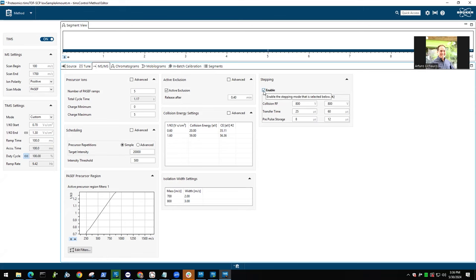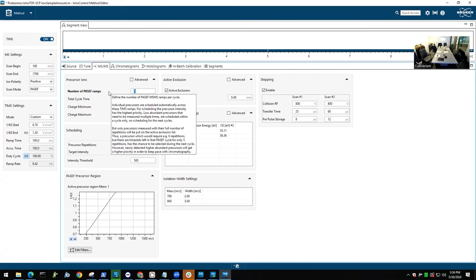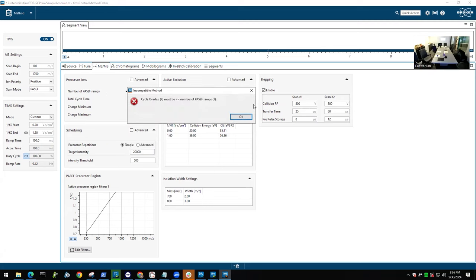But you have to keep in mind when you do this, your cycle time is multiplied by 2 because you do the double ramping. And what I typically do, what I did during the conference, was make a clean method with the TMT. I only did 3 ramps.